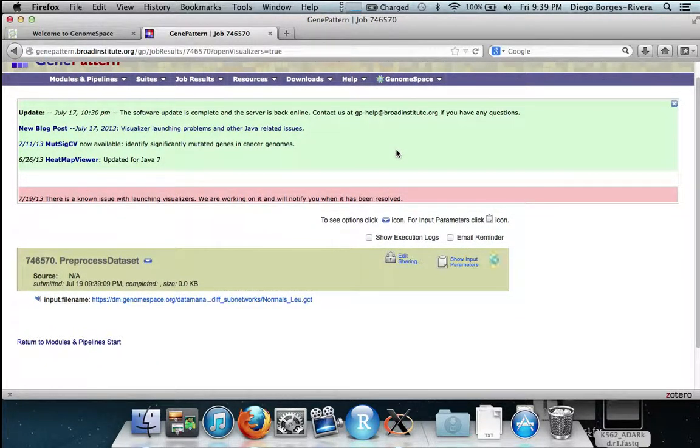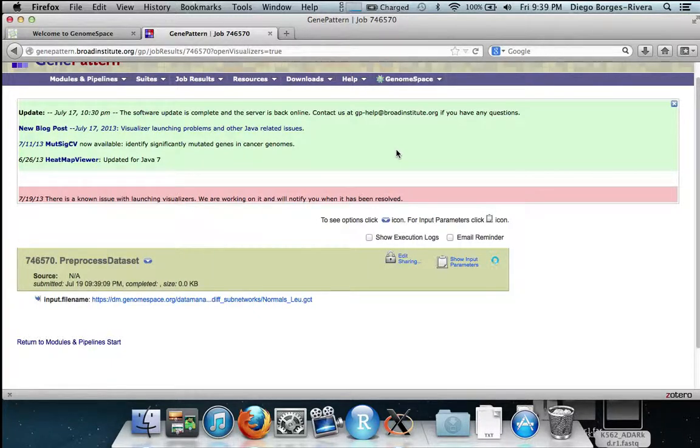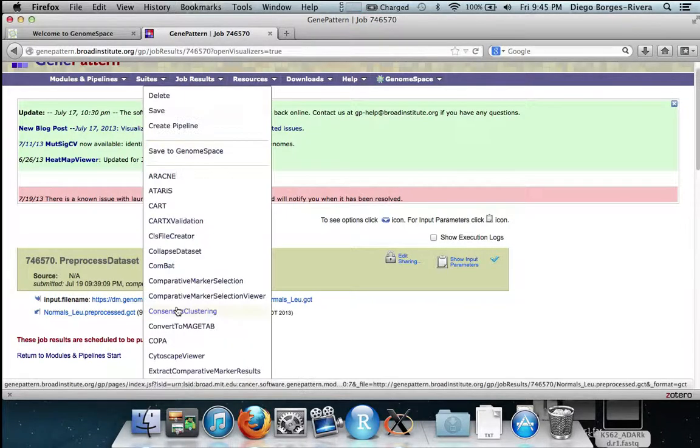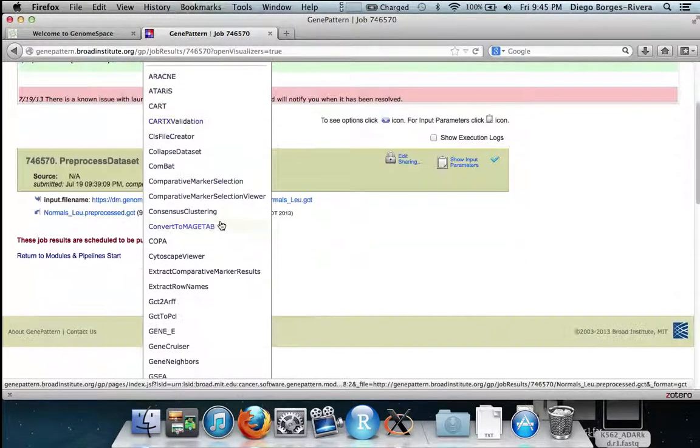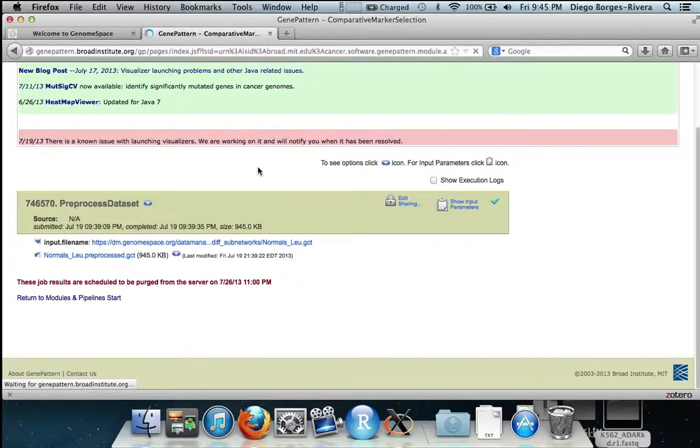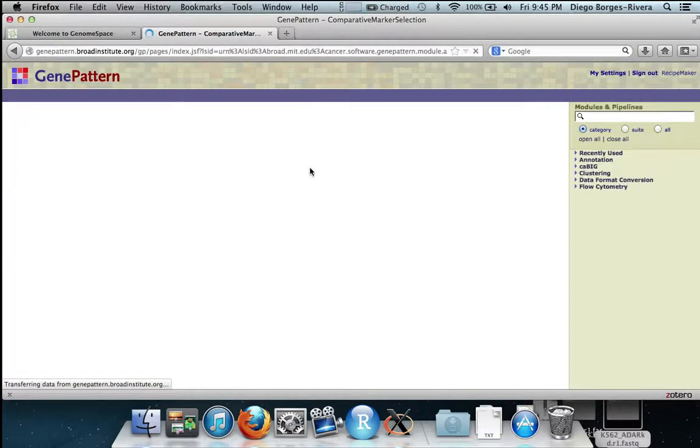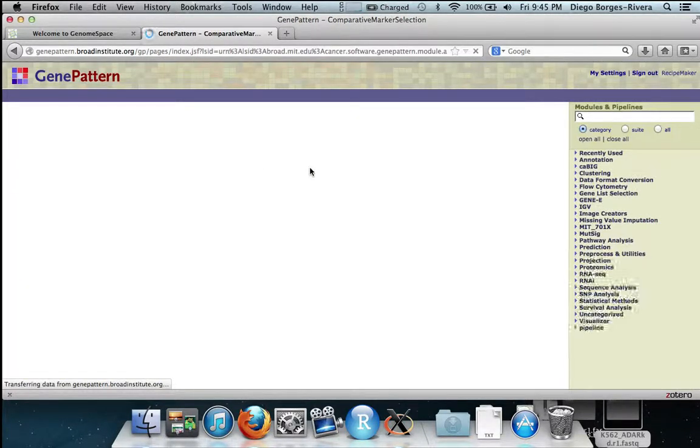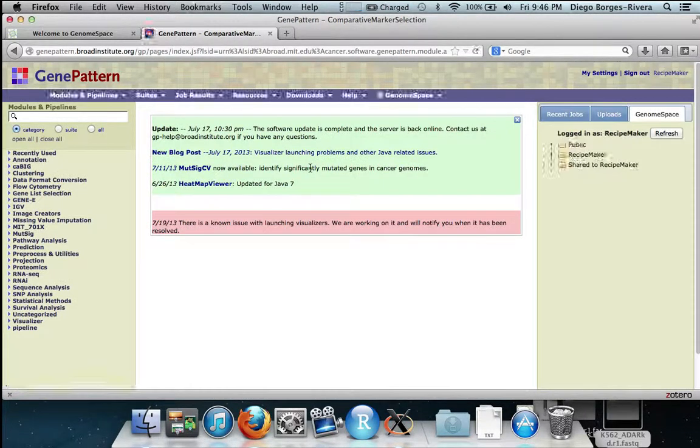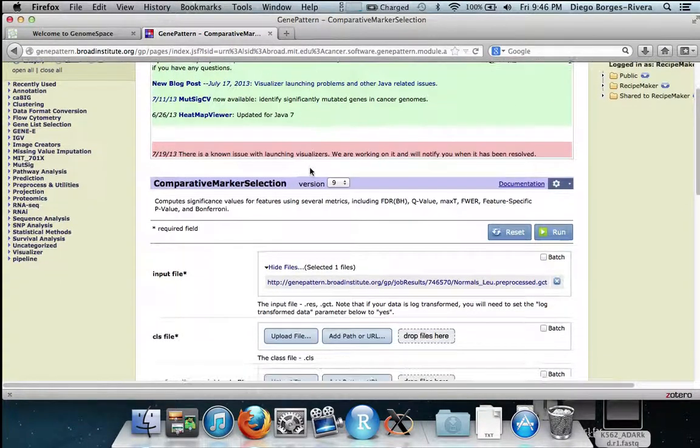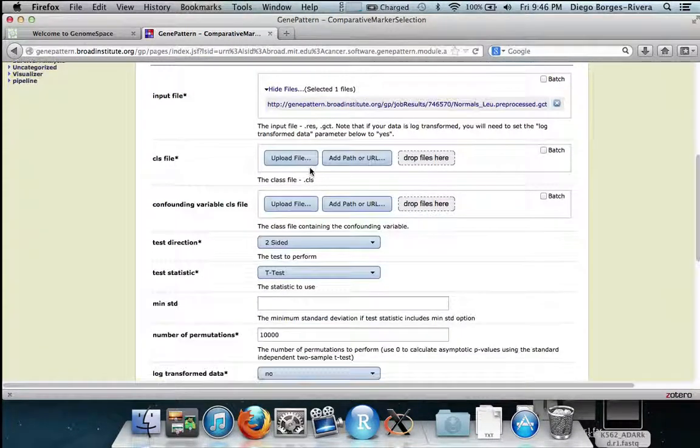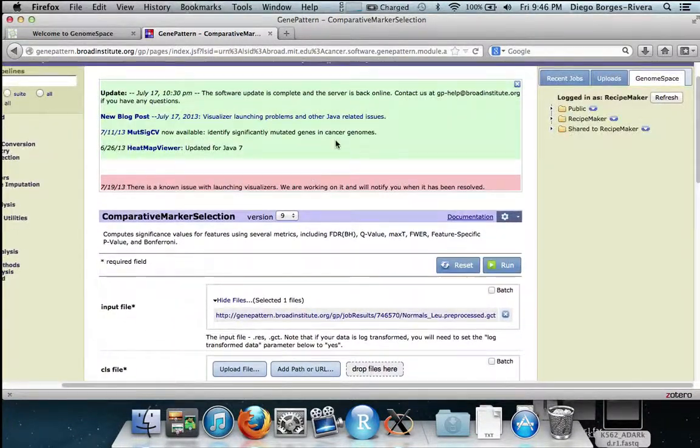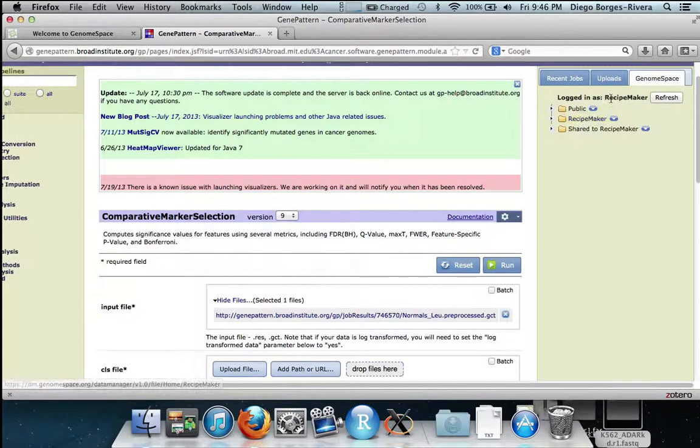To discover differentially expressed genes we now send this filtered expression data set to comparative marker selection by clicking the arrow and hitting comparative marker selection. Here we also fill in the dot CLS parameter which defines what samples are control and what samples are disease, tumor in this case.